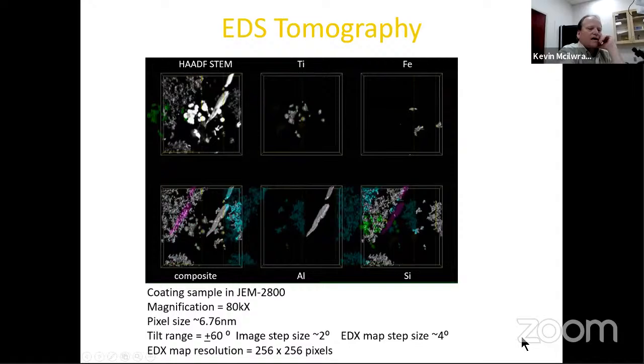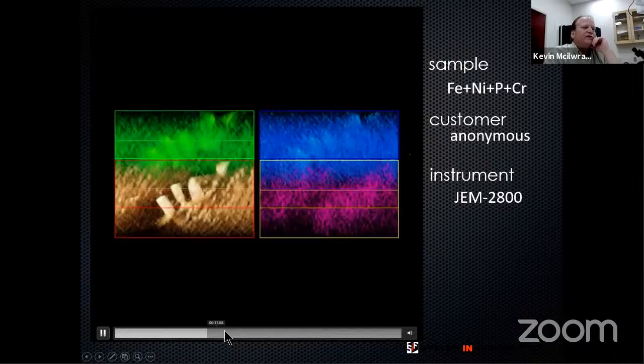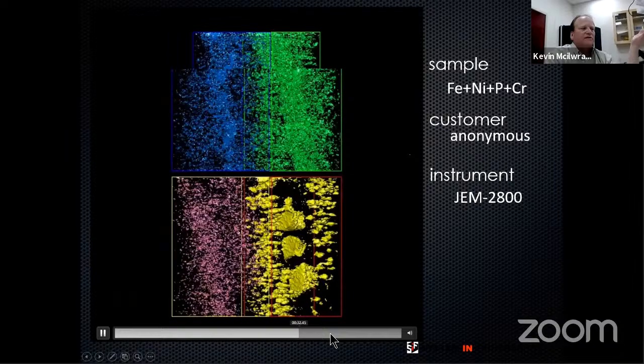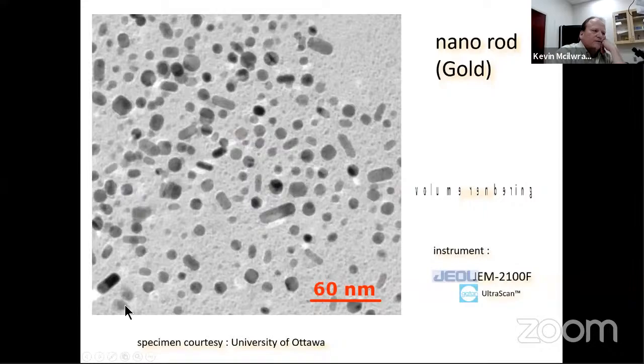Now this is kind of cool. So as we go here, we actually can take this volume. We can then take it out, show tilt samples from that. There's all these different things that we can do visualizing these samples. And I'm gonna skip this because I don't have time. So compressive sensing is something that is interesting. Oh, yeah, here.